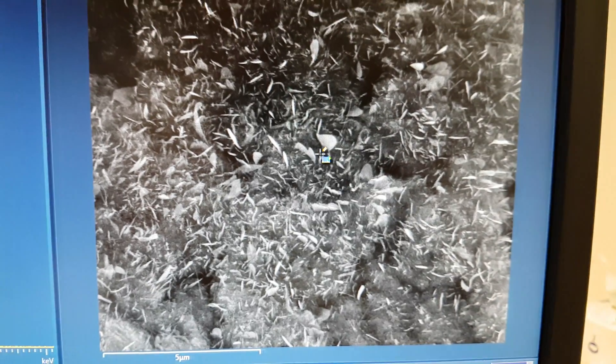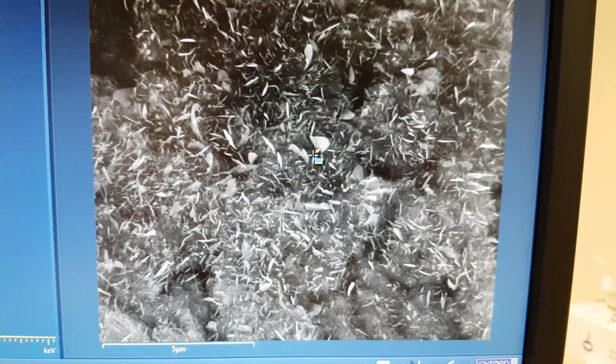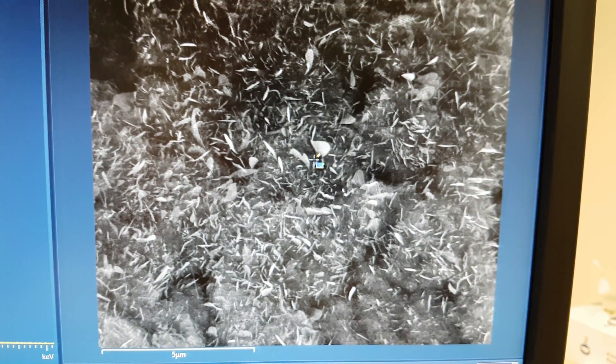And it's quite beautiful actually to look at two areas. You have these kind of disks which are incredibly thin. I mean we're looking at five microns here for that scale and those are nanostructures, fine disks almost infinitesimally thin. And some fuzzy stuff in between but essentially the whole of that is iron oxide.